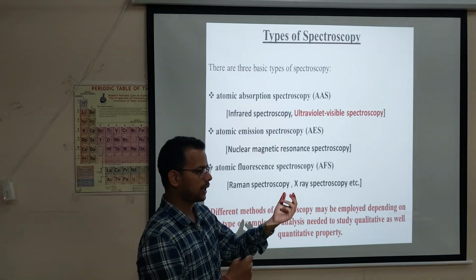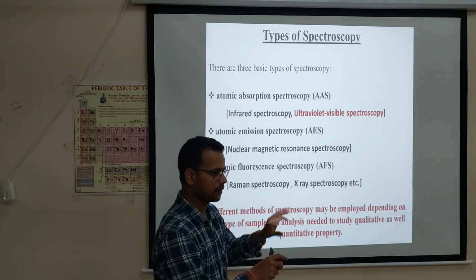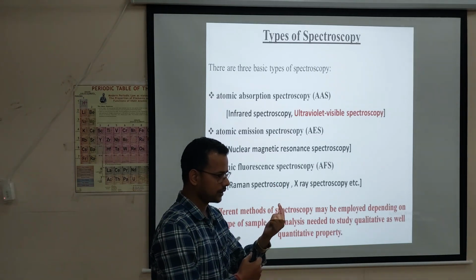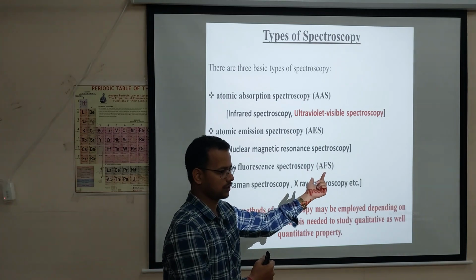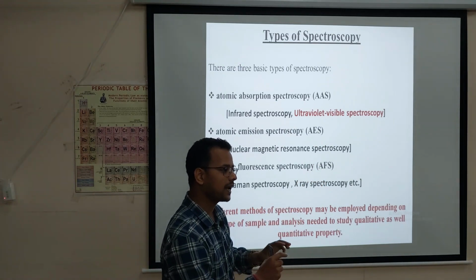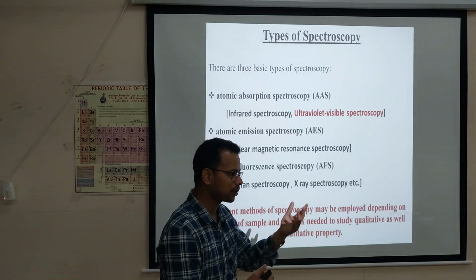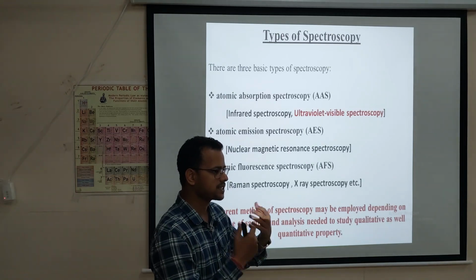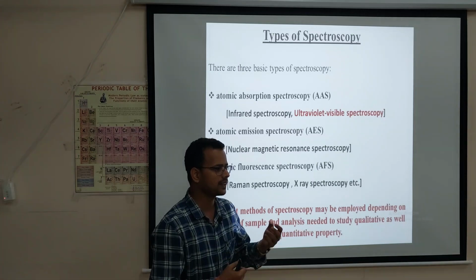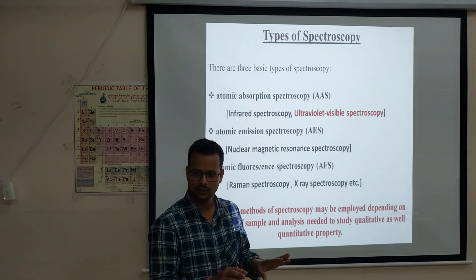So how can we calculate the absorption, how much energy has been absorbed by the sample? The incident is 100, I0, and the transmitted ray, suppose it is 87. So 100 minus 87 is 13. On the basis of that, we can get how much energy has been absorbed by the sample, and the absorption coefficient is different for different materials. Yes or no? If I take ethanol, methanol, for example water, right? Okay.